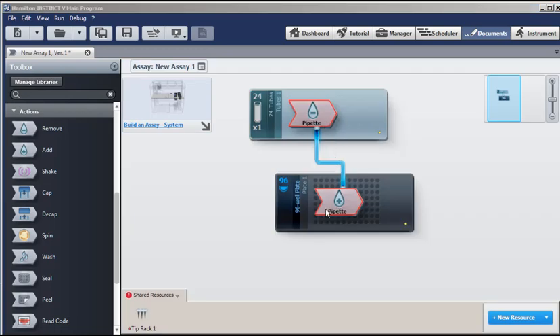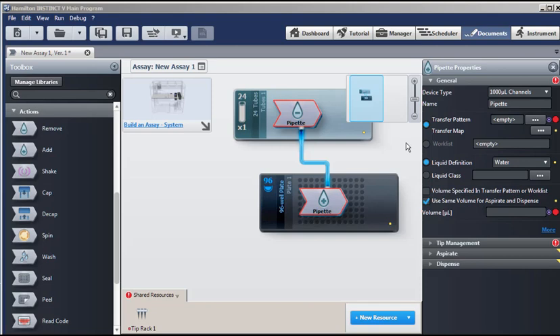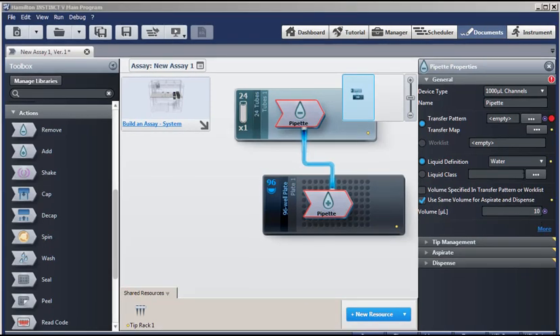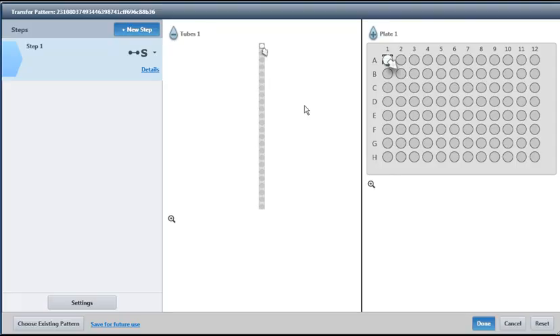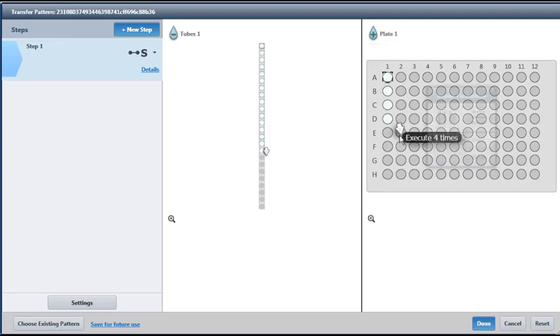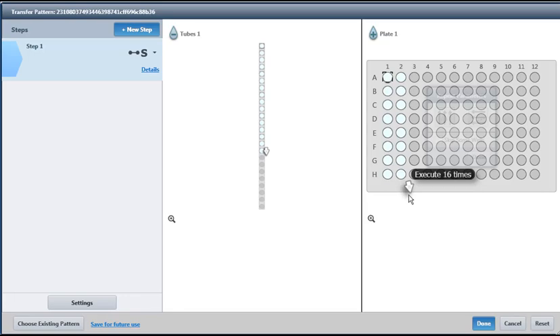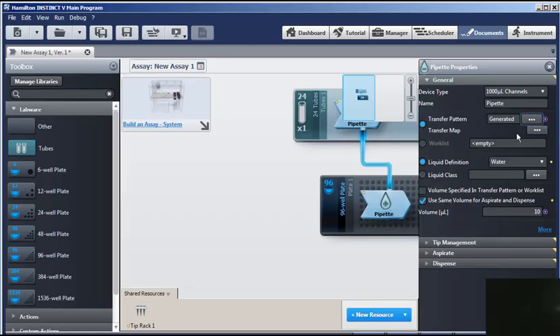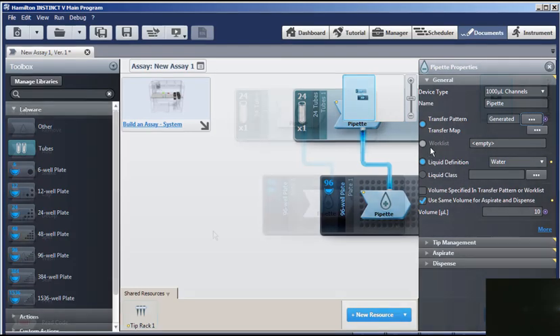And our red outline indicates we need to set the properties. So we double-click. And notice the two red dots. One is for an empty transfer pattern. And the other is for our volume. So we can set the volume to 10 microliters. And the dot disappears. And now for the transfer pattern. By clicking on the ellipsis, the transfer pattern document appears. And we will select the first 16 tubes from our source, 10 microliters each to the first two columns of our 96-well target plate. And we'll click done at the bottom. And now our transfer pattern has been generated. Because every pipet requires either a transfer pattern or a work list.